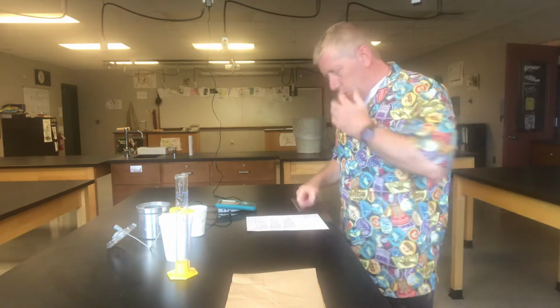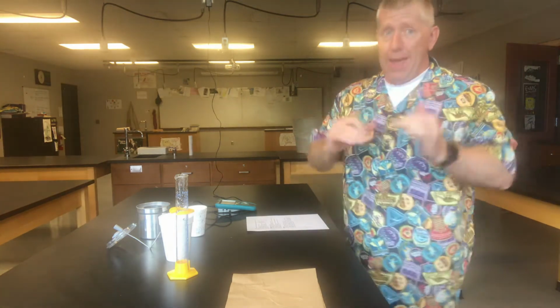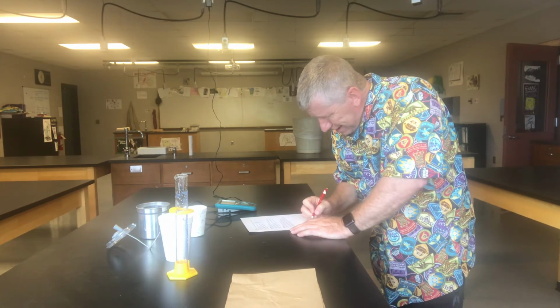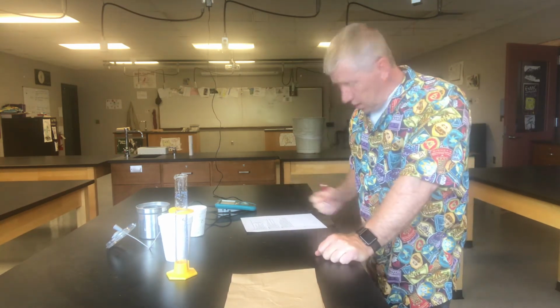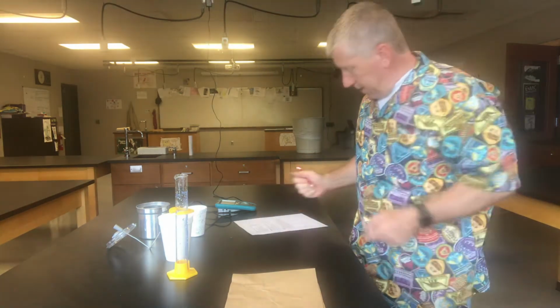So now let's take those two numbers and add those, and we'll get the total volume of the water and melted ice after we did the experiment. So adding those, it's 4, that's 12, that's 3, that's 9, 10, 11, 12. So I'm getting 123.4. What do you think, lab partner? Let's check it again. 8, 13, 10, 11, 12. 123.4 milliliters is the total volume of the water and the melted ice cube.